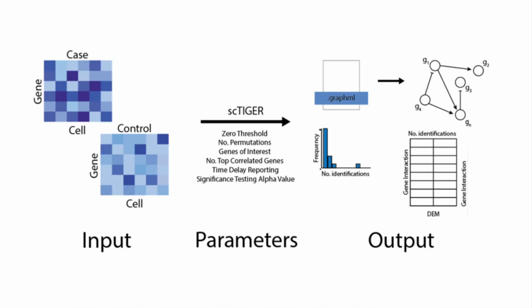This is a brief schematic of scTIGER processing. I have provided a more detailed graphic at the end of this video if you would like to know more about how scTIGER processes data.